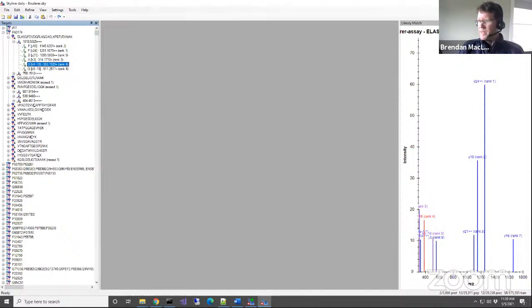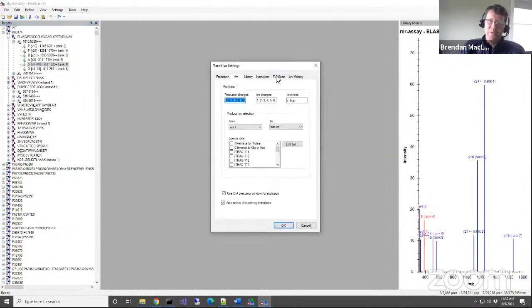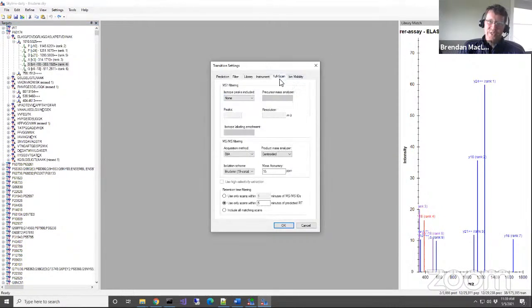I forgot whether this was mentioned earlier, but is it better to process DIA using TOF because of speed? What is the difference if Orbitrap was selected as the MS analyzer in the setup? It was mentioned yesterday. I recommend at this point, if you're in the full scan tab and you're using a Thermo instrument, use mass analyzer centroided and use mass accuracy.